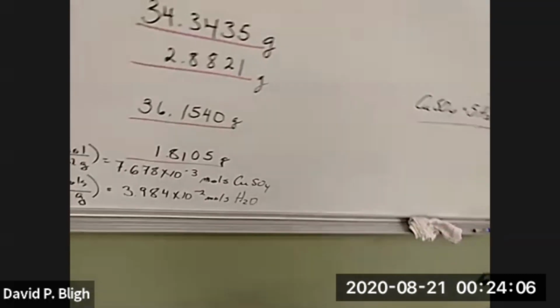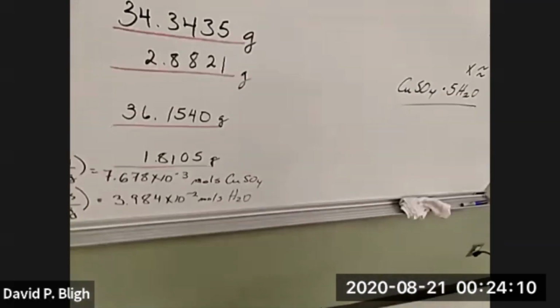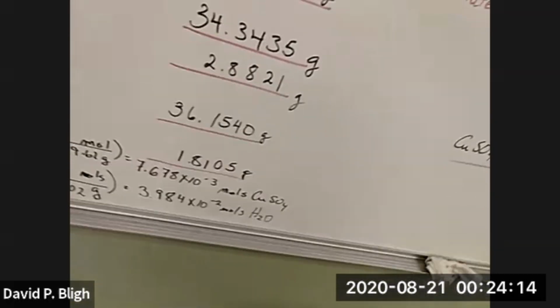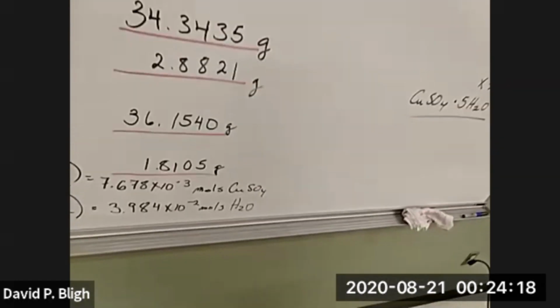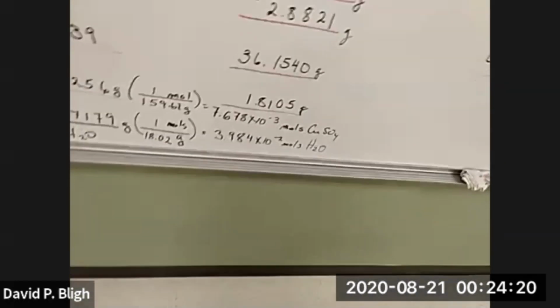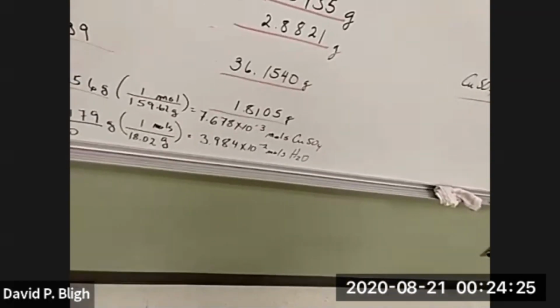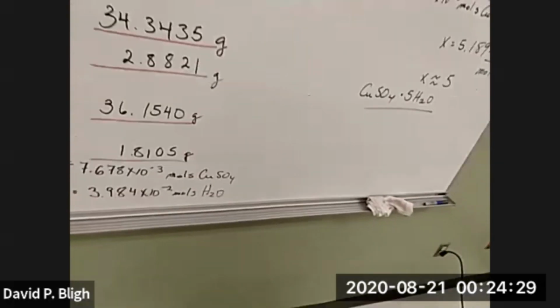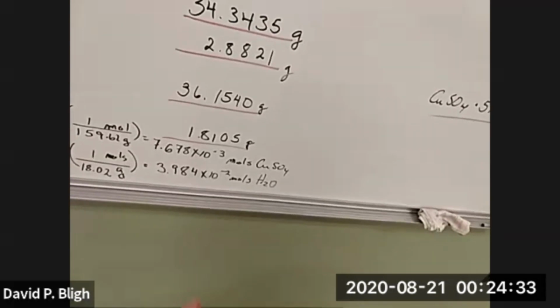For sodium hydrogen carbonate, the difference in weight is not as critical to deducing what's going on, because the difference in weight is only partially due to a loss of water. We probably lost some gases as well, like carbon dioxide, or it could have been carbon monoxide. But that's why the extra document that I put in Blackboard for you discusses those possibilities.